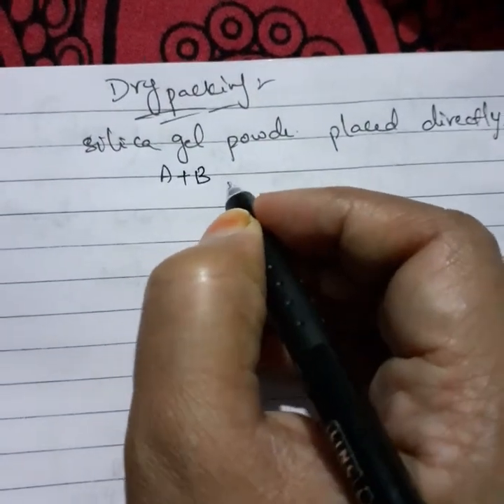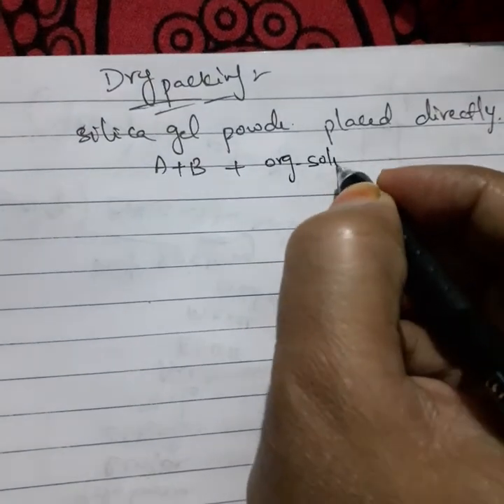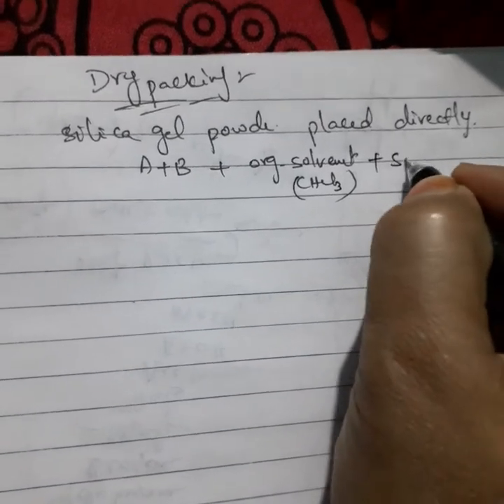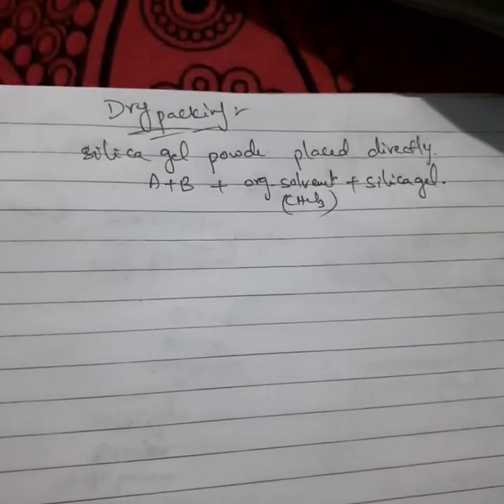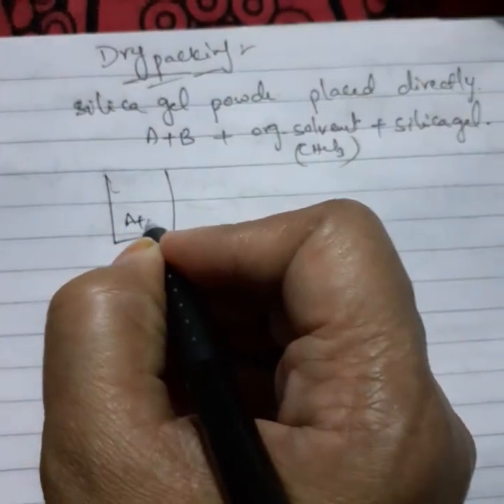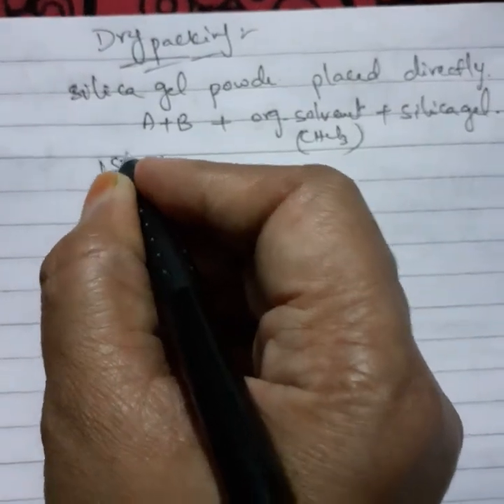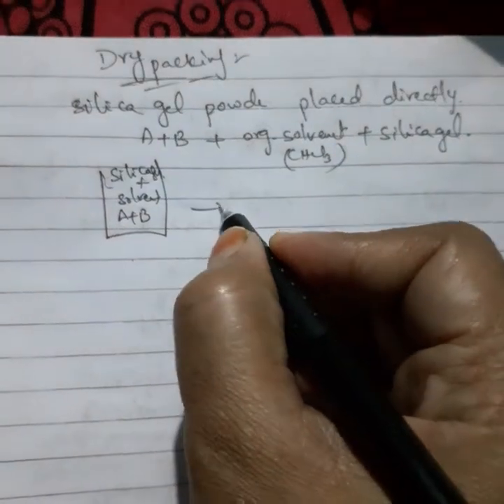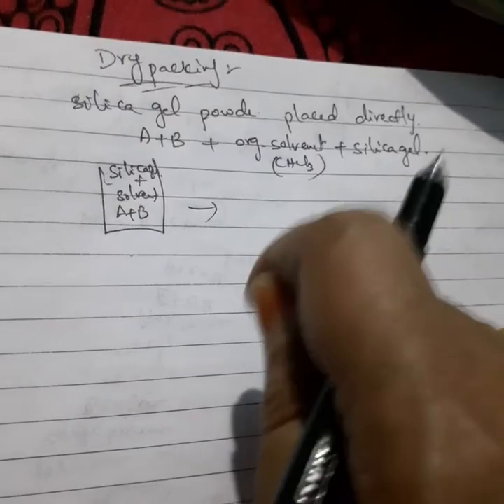So first the reaction mixture is added to the suitable organic solvent, that is CHCl3 here, and this silica gel powder is also added here. Means take a beaker, add this A plus B and this organic solvent, and a little bit of silica gel powder. After some time, you need to make it in the form of a paste.